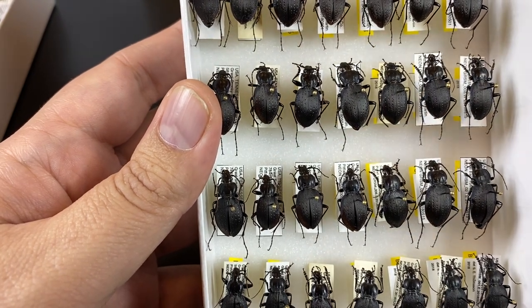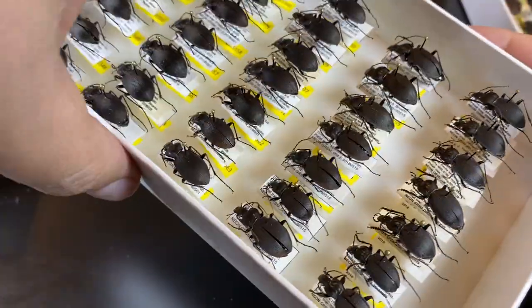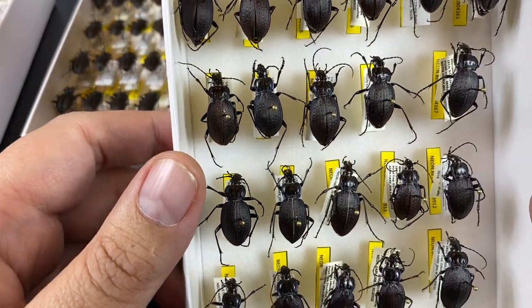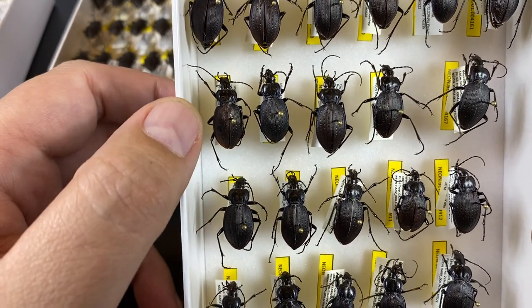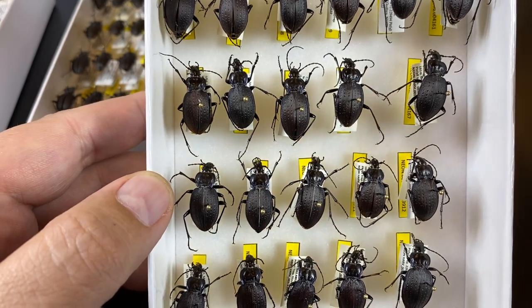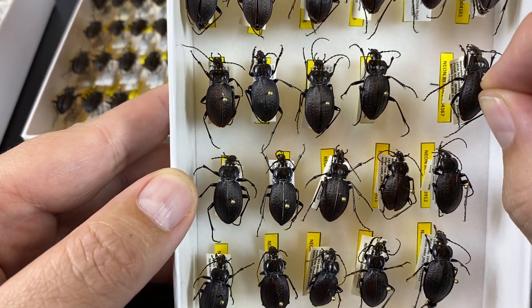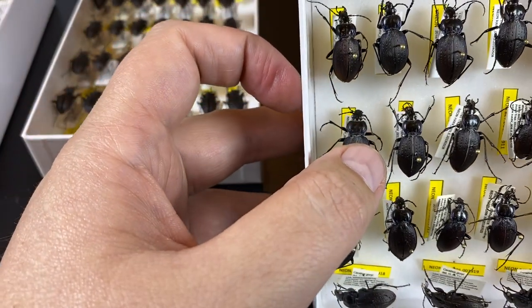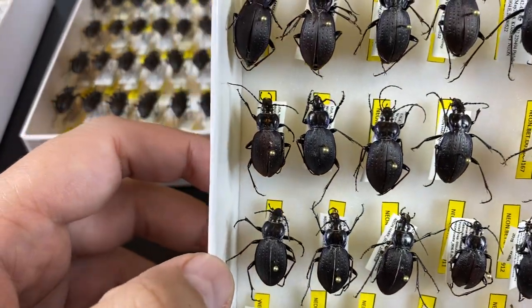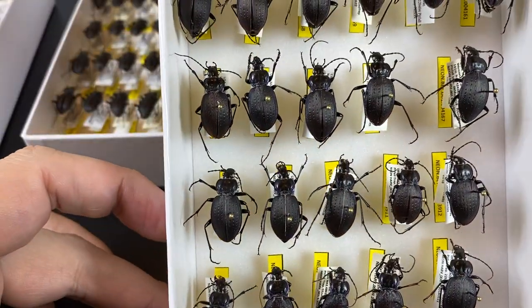One big thing to think about with specimens is long-term preservation: are the appendages and body going to stay intact while this unit tray gets moved around and specimens get pulled out for future research? In this second tray — same species — these are just a little less neat. The antennae are sticking out, so we weren't really able to utilize the side of the unit tray because these specimens required more room. And inevitably, we can already see damage — most specimens are missing the ends of their antennae, and some are missing tarsi and bits of their legs as well.